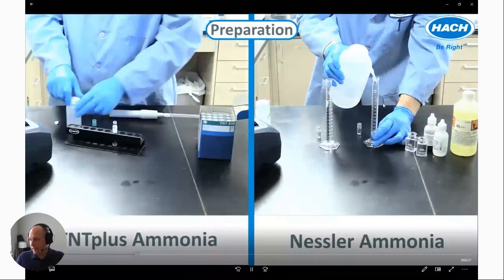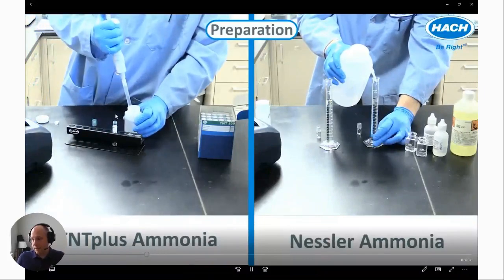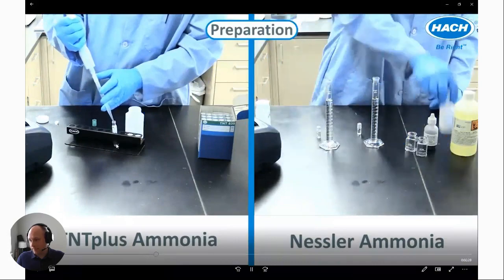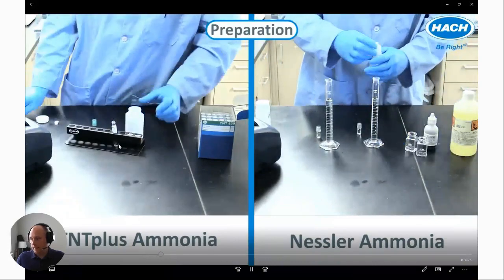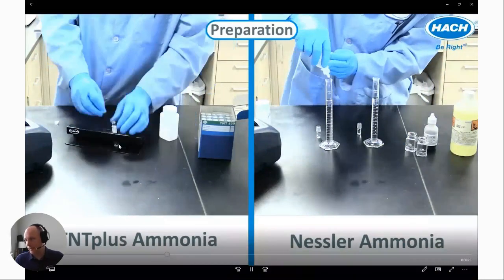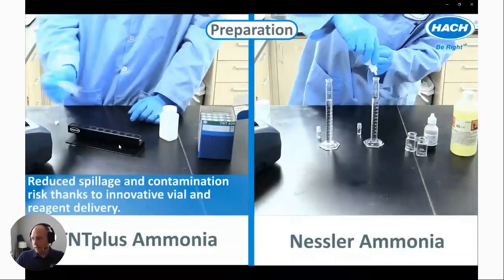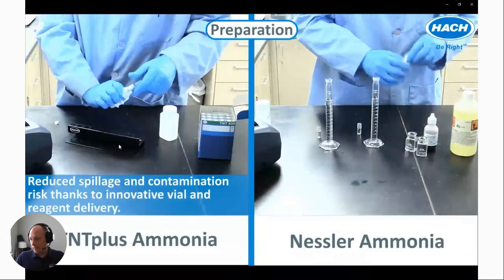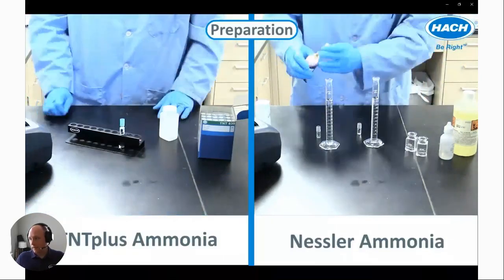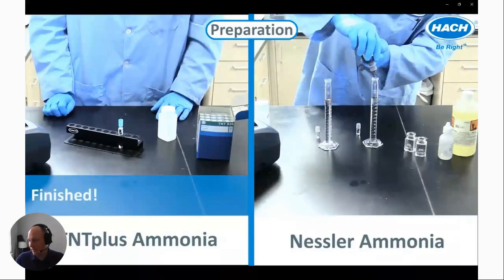Doing it with a bottle here. On the left-hand side, we got a TNT Plus vial, and we're just adding sample directly to the vial. And that is it as far as reagents. On the right-hand side, we're adding the first reagent. Wiping off the vial here just to get it clean. Adding the second reagent, and I'm already finished on the left-hand side.